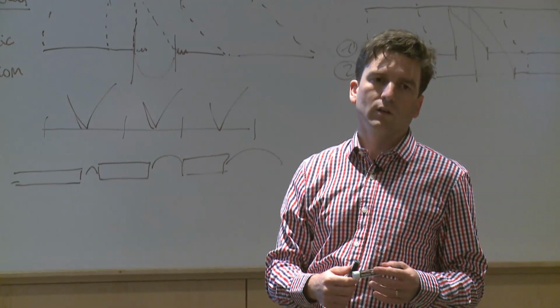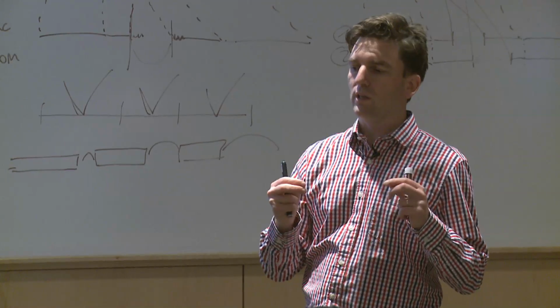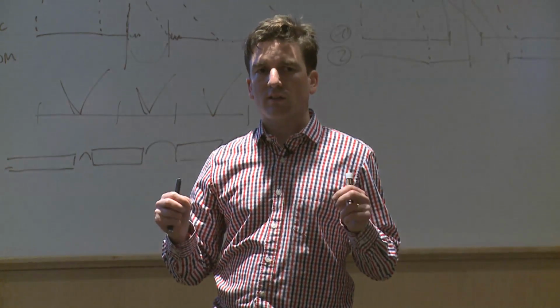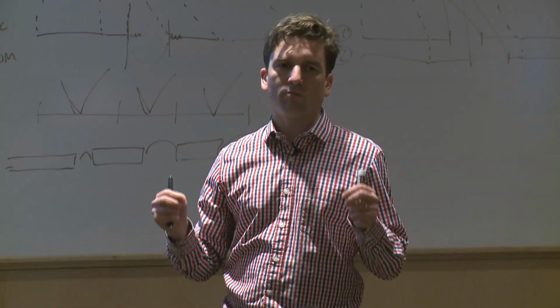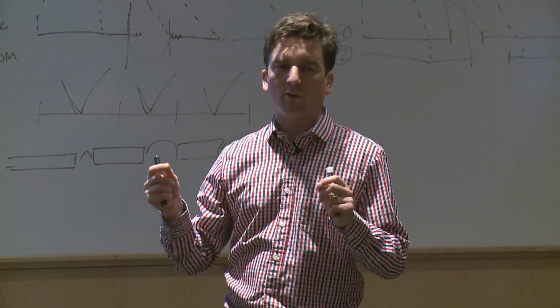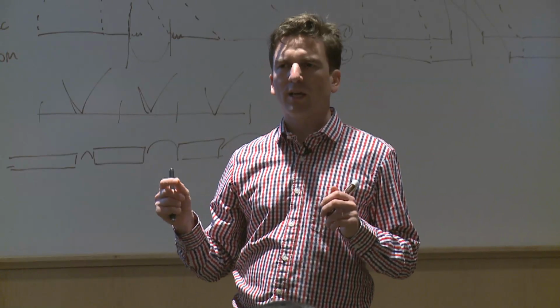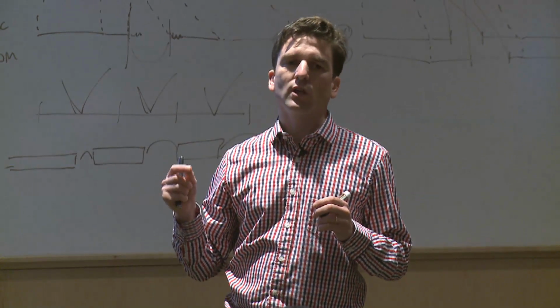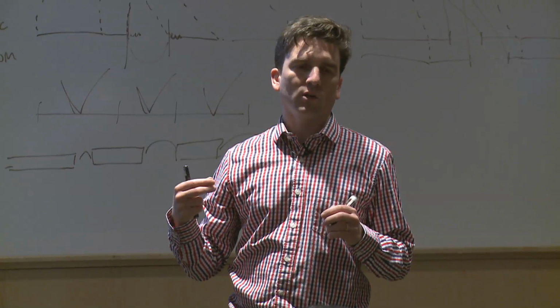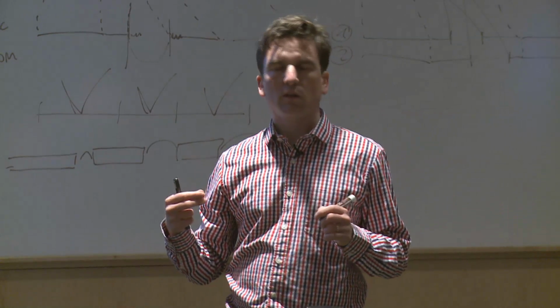So the warning for TopHat or for Bowtie is that it's clearly developed for mammalian genomes, and there are a few parameters that need to be changed for other ones. I don't think you can change the knowledge of the canonical splicing sites or consensus sites.